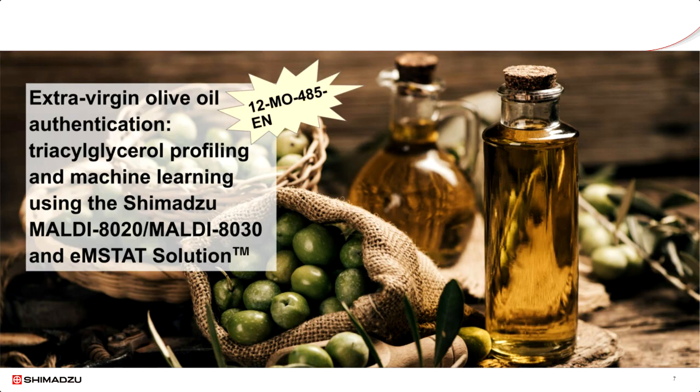So starting with the first application, this is about how we can use MALDI-TOF MS combined with multivariate analysis and machine learning to tackle the issue of extra virgin olive oil adulteration. An application news is available for this.